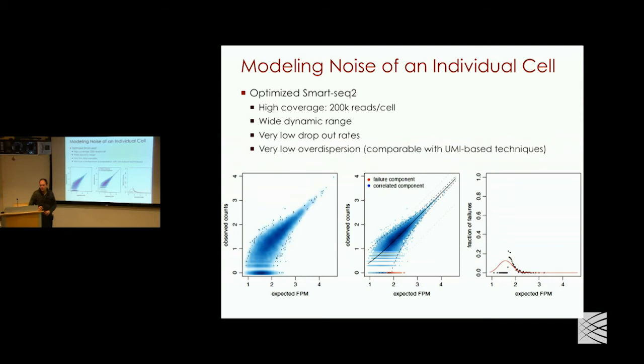So this is a dot for every gene across the entire data set? No, it's a single cell. It's just one cell. The expected magnitude is derived based on the set of cells that was in the neighborhood, except for that cell, obviously. So it's sort of averaged across a part of the experiment. But the counts are for the single cell because we're trying to infer parameters for a single cell.